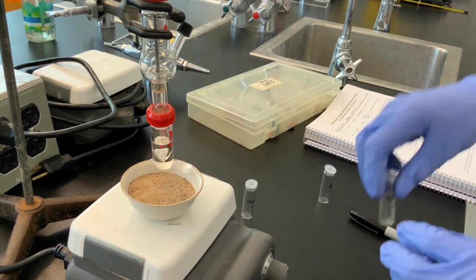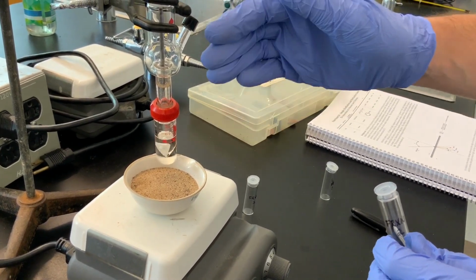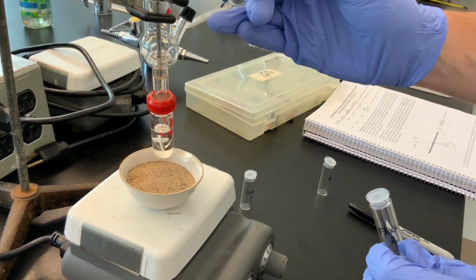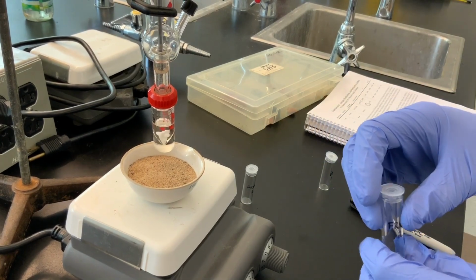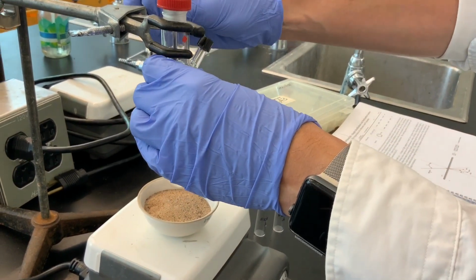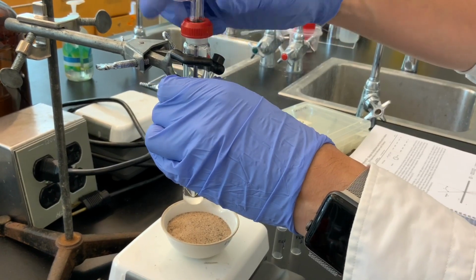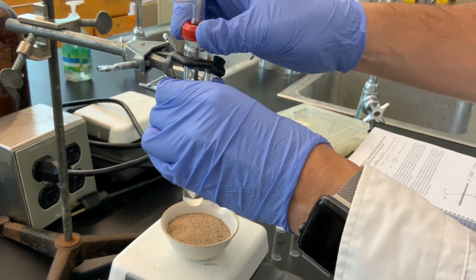And then fraction 2 is going to be that in-between period. So when hexane is done distilling and when toluene is starting to distill. So obviously this will have to get warmer. We're going to increase our temperature here, and we might even use some aluminum foil to help insulate our setup because it's much higher boiling.